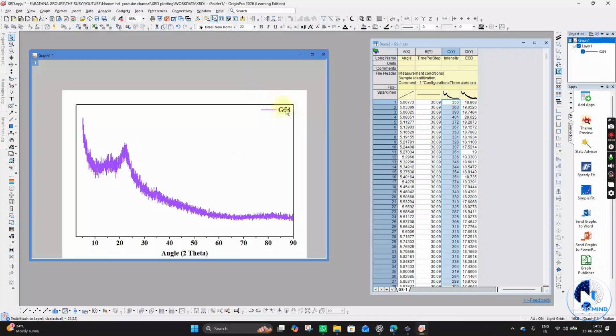And if you have a lot of sample names filling up the plot, you can just reduce it by one point. You can maintain it at 18, like this. Just select all, go here, type and enter, and you can maintain it like this. In this case you need not change the sizing of any other things. Just change the size inside the names.